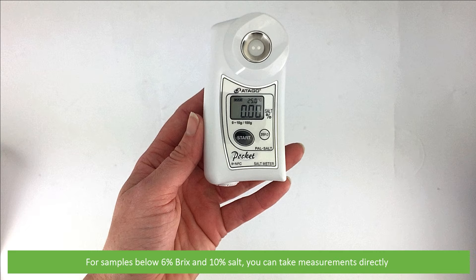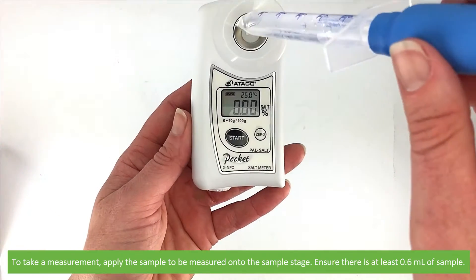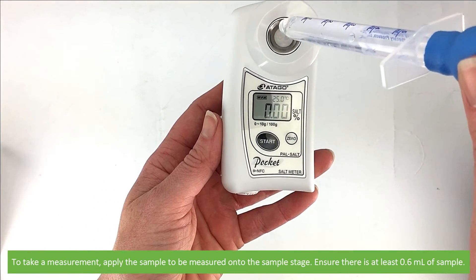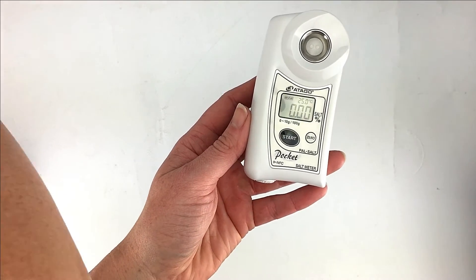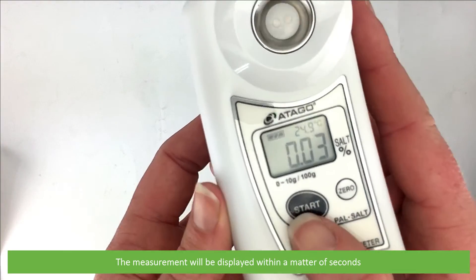For samples below 6% brix and 10% salt, you can take measurements directly. To take a measurement, apply the sample to be measured onto the sample stage. Ensure there is at least 0.6 mls of sample, then press start. The measurement will be displayed within a matter of seconds.